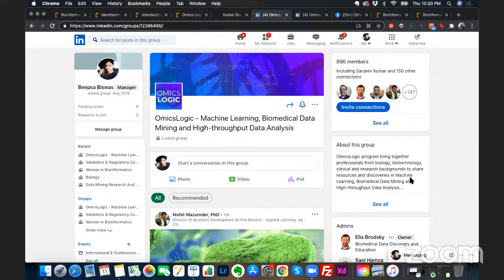But once the data sets are processed and they're ready as a table, you can then do the downstream analysis and visualization in R and in Python. And that is a big part of what we will do in the program as well. First of all, understanding the logic. Why are we doing what we're doing, and what do these visualizations mean? And then doing it ourselves in R and learning how to manipulate the data, wrangle it, visualize, and interpret.